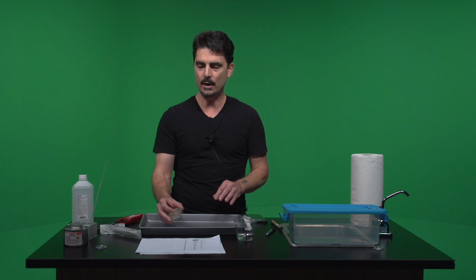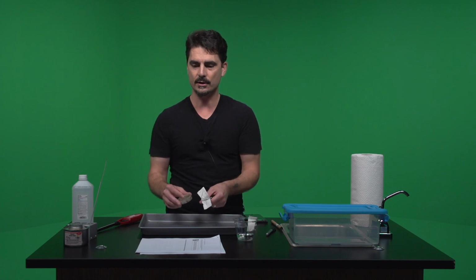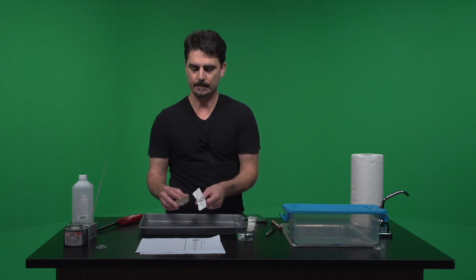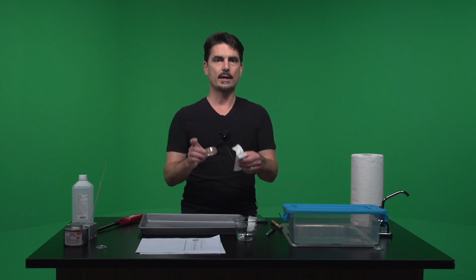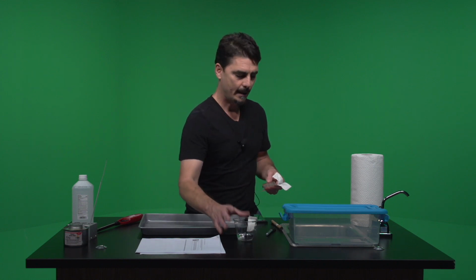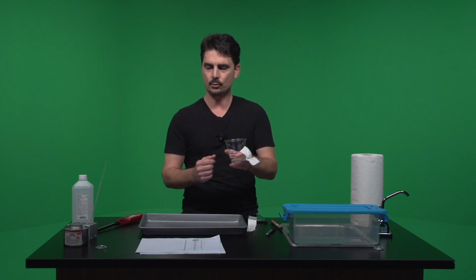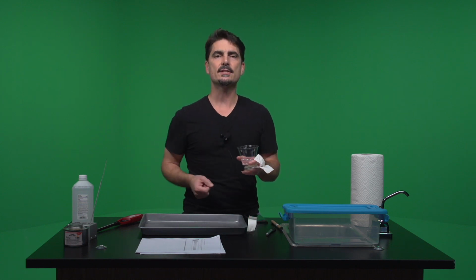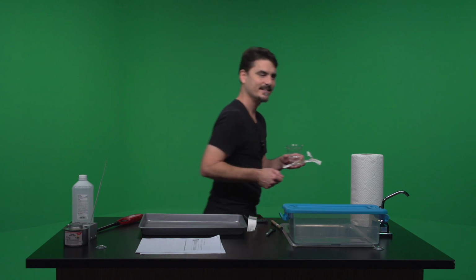Now, if you were also doing a door handle or something, that's where you take the stuff that you're going to use and go to wherever it is that you're going to swab from. So what we're going to do is grab our swab, our soil, and our distilled water, and head outside and get into some soil. So let's go do that.